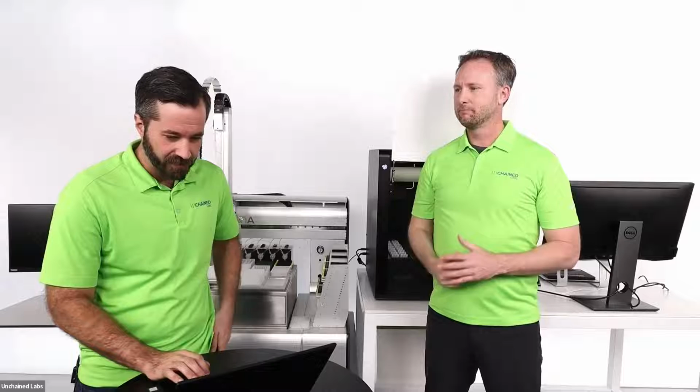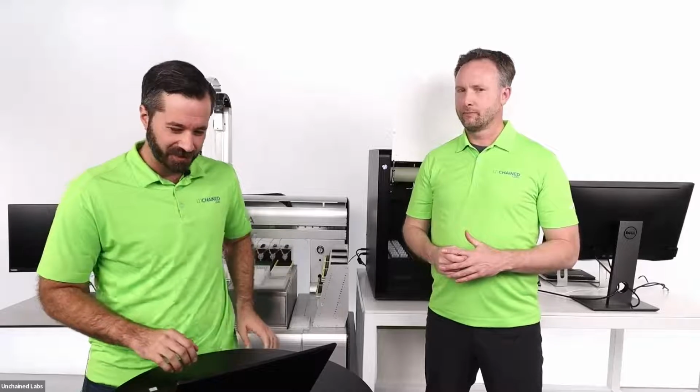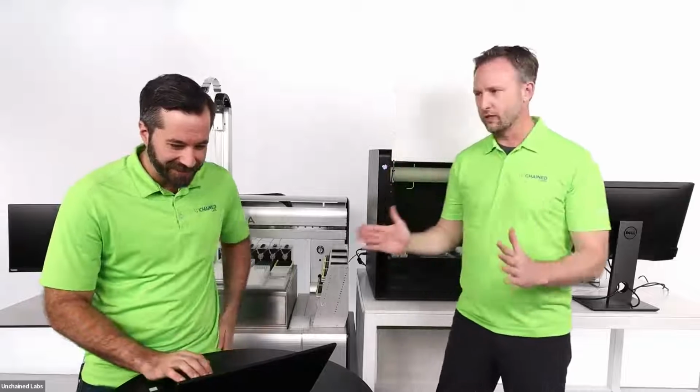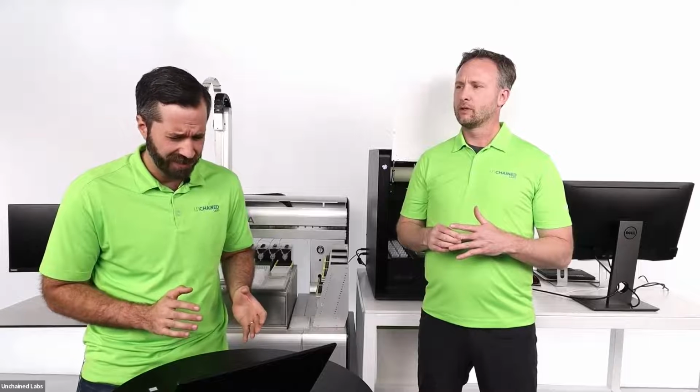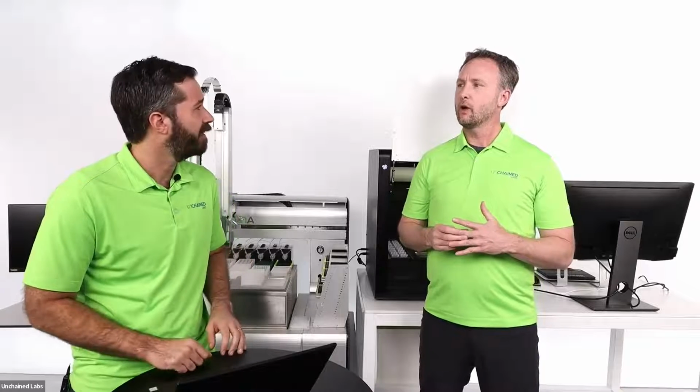Okay, all right. A question here came in. Pretty complicated, pretty specific question, so I'll try to read this out verbatim. What is the recovery rate for low concentration samples? So this looks like 100 to 300 micrograms in 200 microliters. I guess that works out to half a mg per mL up to about 1.5 mg per mL for a 96 well plate. Okay, yeah, good question.